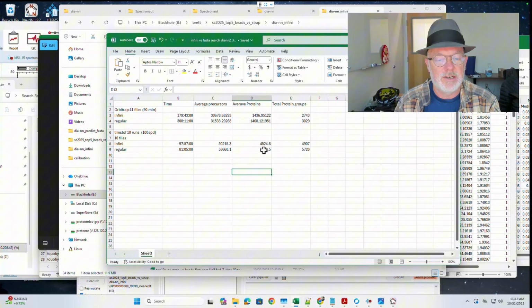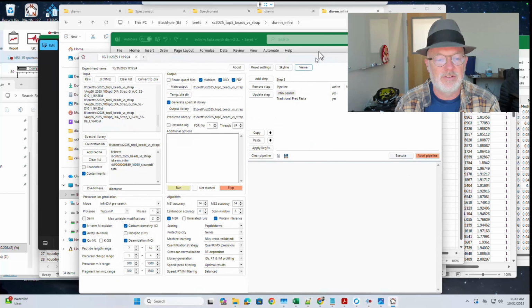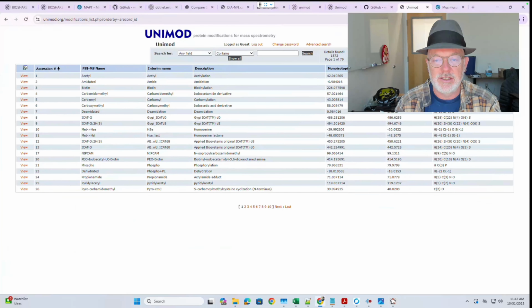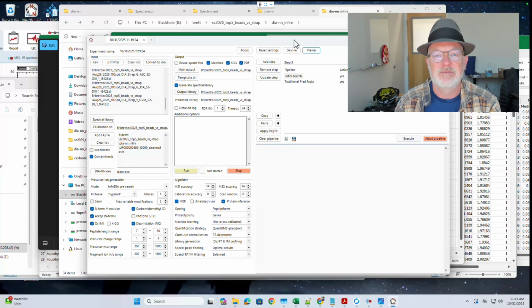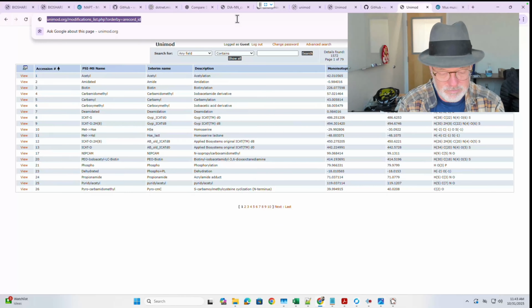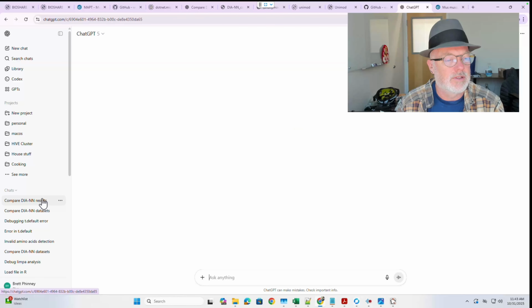All right, so that's basically it for the new DIA-NN. It's super easy to use. I did analyze this data set a little more. Let's see, where did I put it? Maybe I can just open it here.